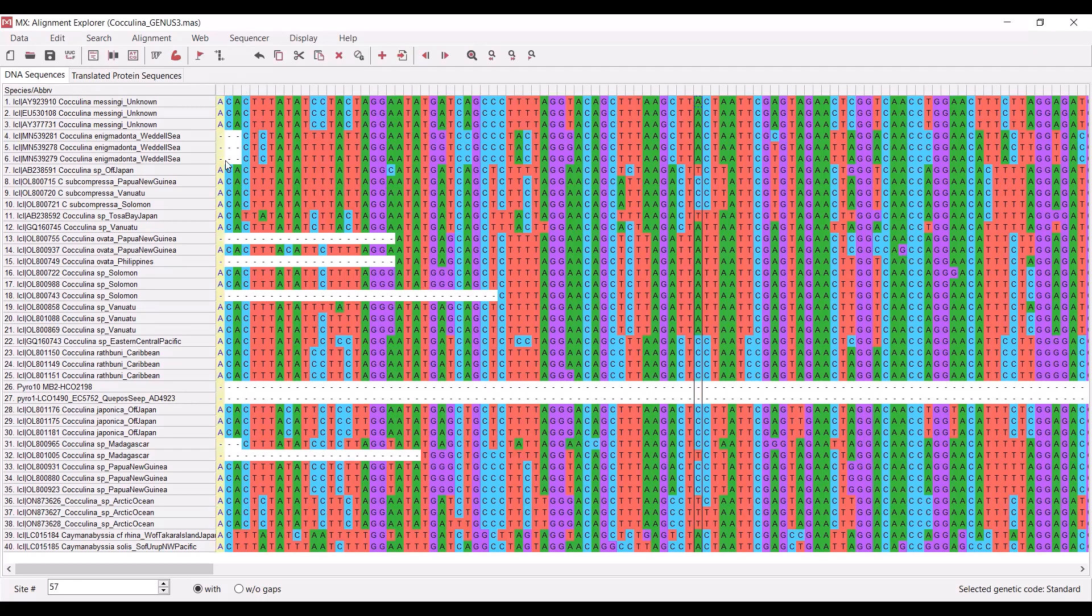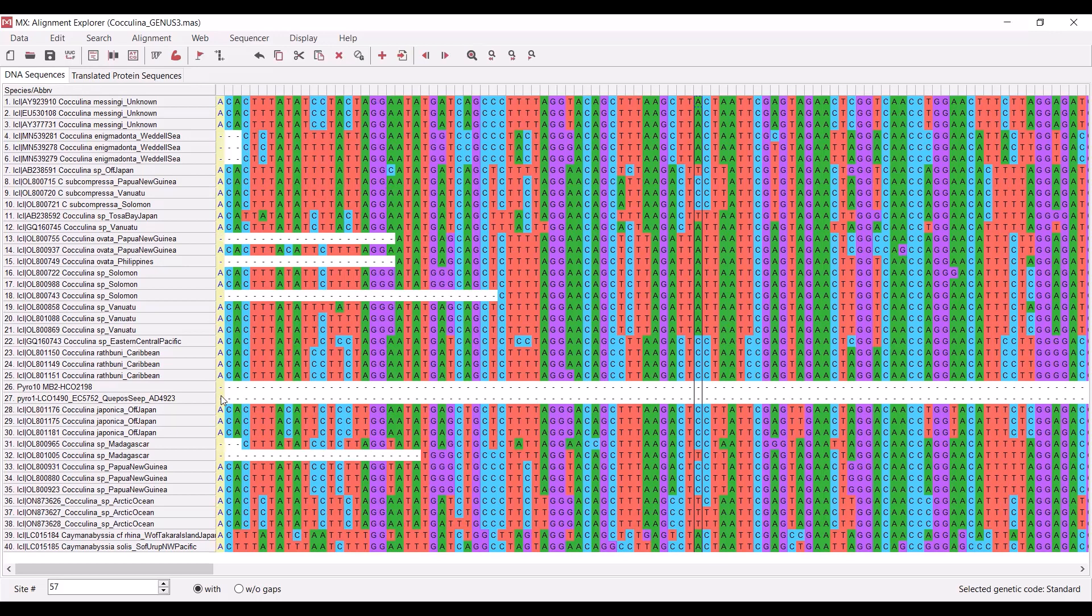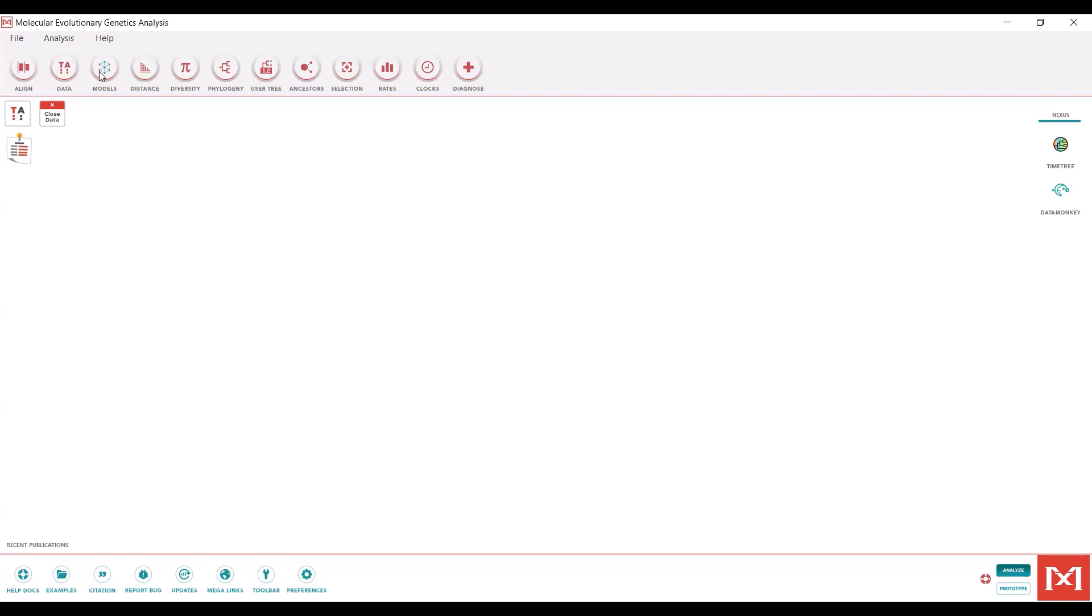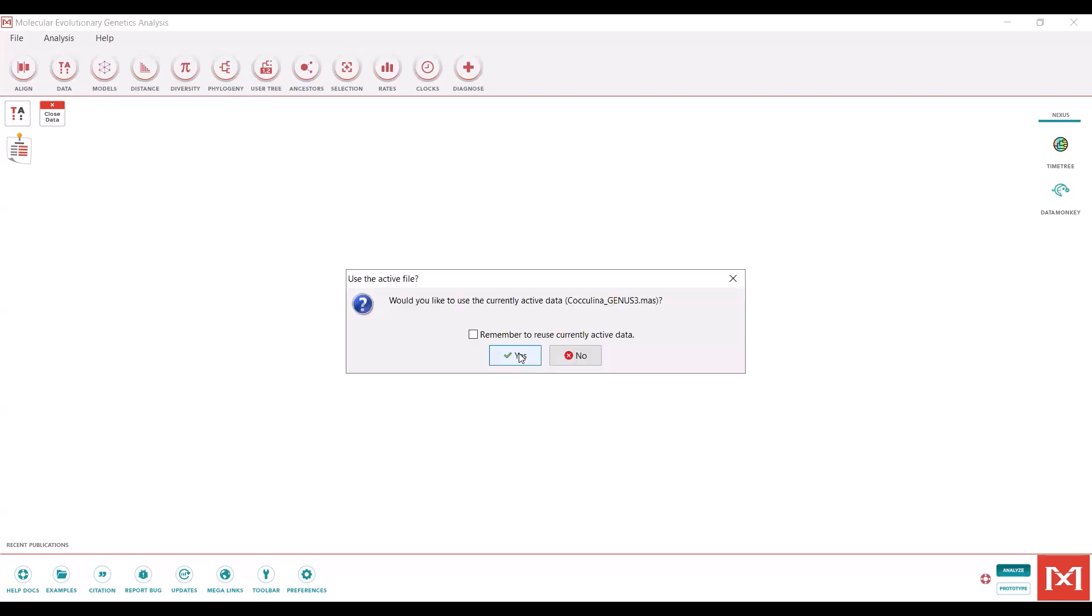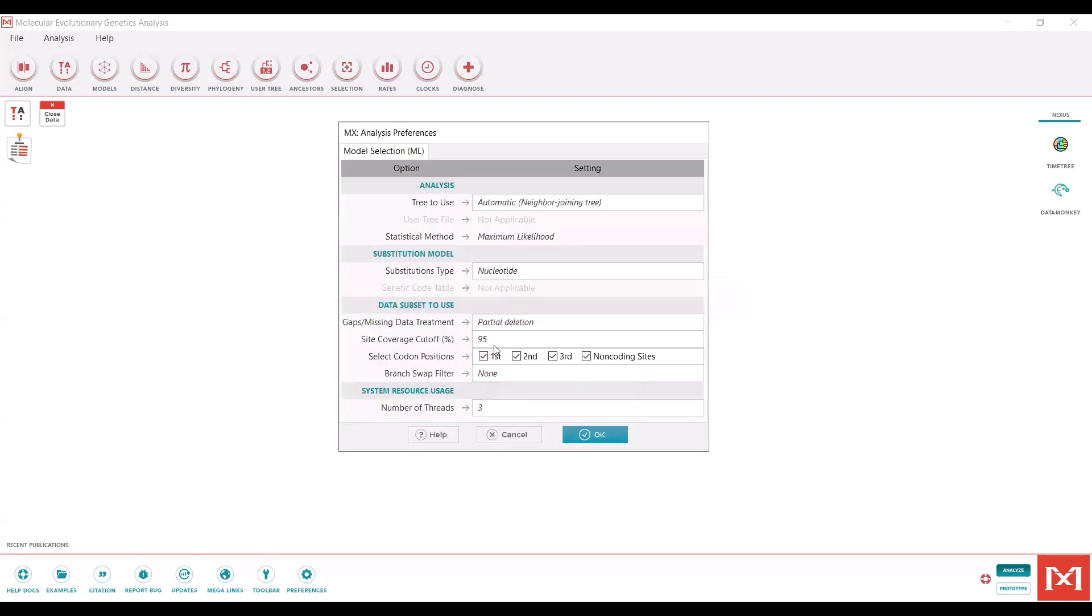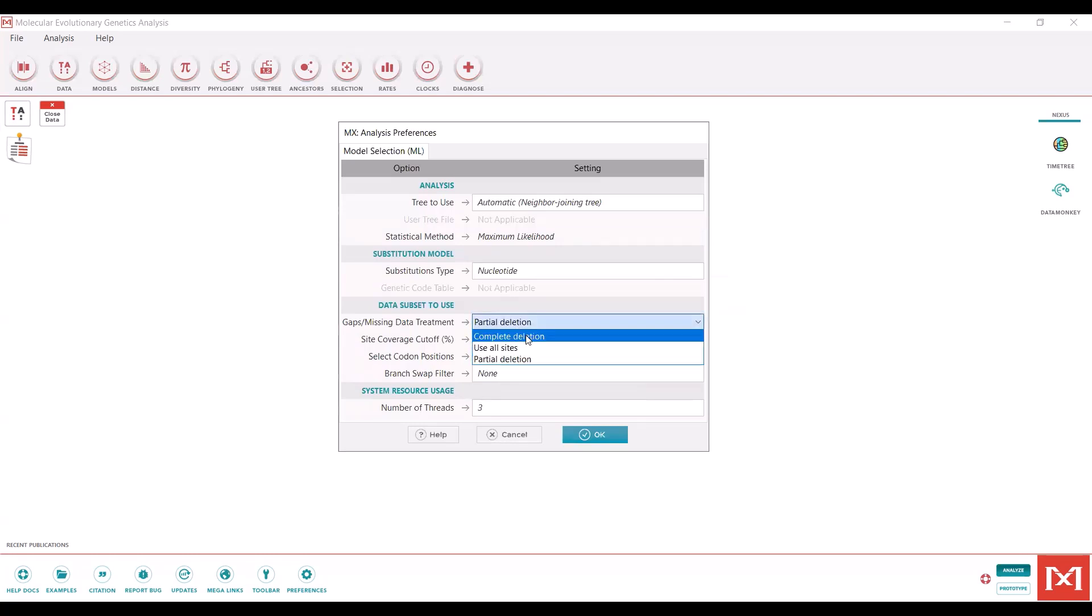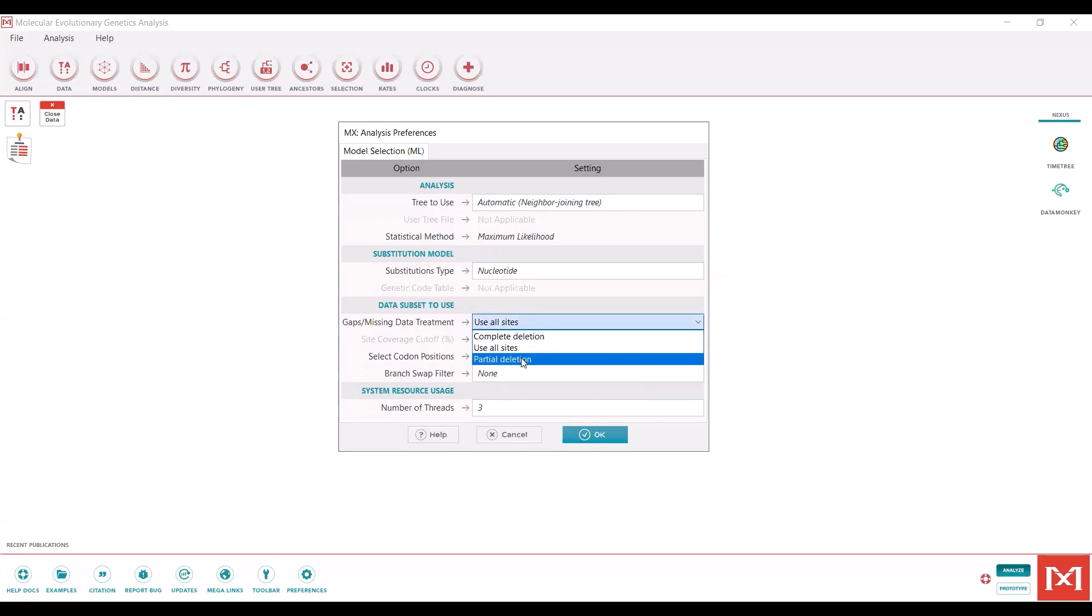If we have less than 95% coverage at a base position, such as this position at the very beginning, this base position will most likely not be included in the alignment. Depending on what your sequences look like, you can adjust this threshold as needed. You can also do complete deletion or use all sites regardless of missing data. Partial deletion is always kind of the best case scenario, in my opinion.